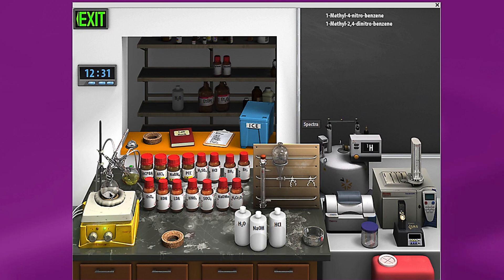In that case, you'll just have the two nitro and the four nitro. You'll be able to separate them completely, and you'll end up with the four nitro remaining in this flask and the two nitro here in the collection flask.